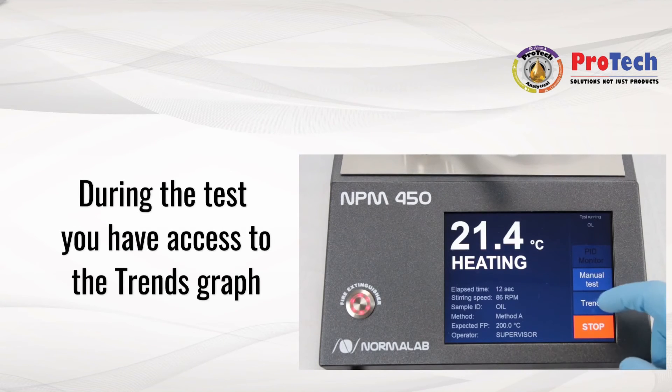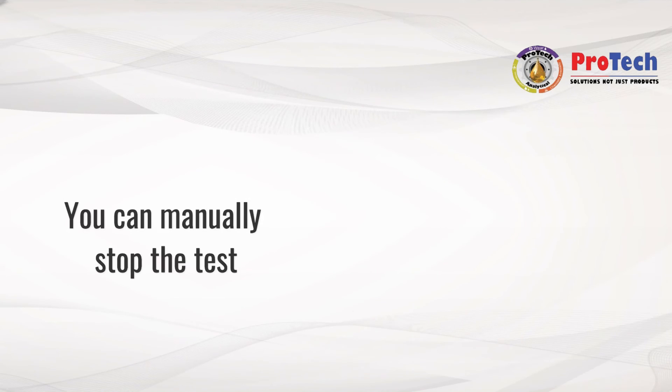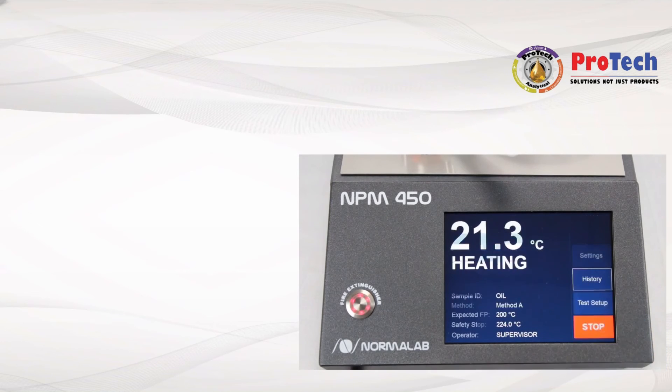You can follow the heating speed, the sample temperature, and the stirring speed. You can manually stop the test by pushing the stop software button and validating your choice.